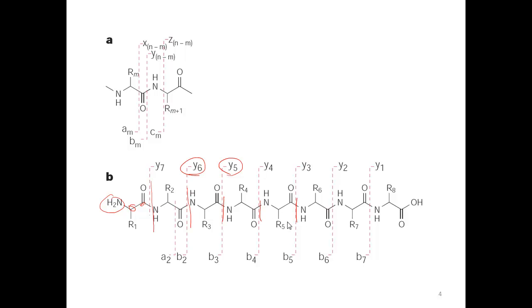Now here's a miraculous thing. If you put this peptide into the gas phase and you put it into a mass spectrometer and you bombard it with atoms of an inert gas such as argon or helium, there's going to be collisions, which is going to impart kinetic energy from the gas to the peptide, and it's going to produce fragments of the peptide. It's rather remarkable, but the peptides tend to fragment right along the peptide bond, so that if you have an overall peptide, each peptide will on average fragment once.